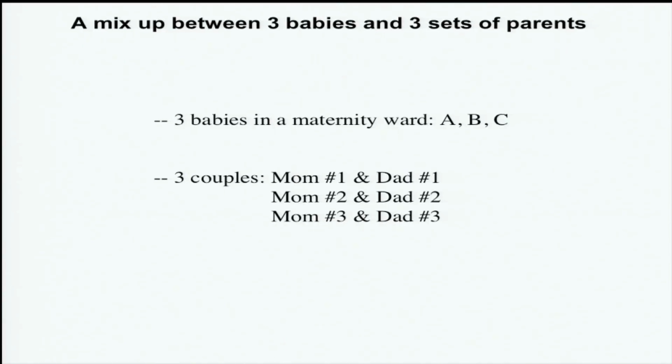And now I'd like to do an example with you. First, we're going to do an example with paternity testing, and then we're going to do an example with forensics of how to use this technique. So on my next slide, I'm going to show you the introduction to this exercise. The first example is that there's been a mix-up in a maternity ward. And there's 3 babies, A, B, and C, and 3 sets of parents, 1, 2, and 3. And we're going to match which sets of parents go with which baby. So on your worksheet, you'll see a similar picture to the one I'm showing on my next slide.